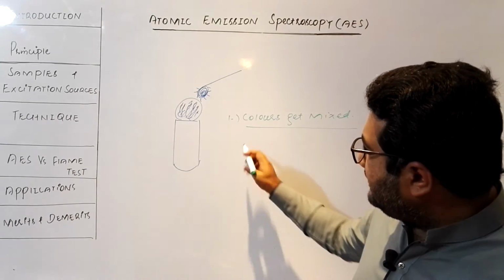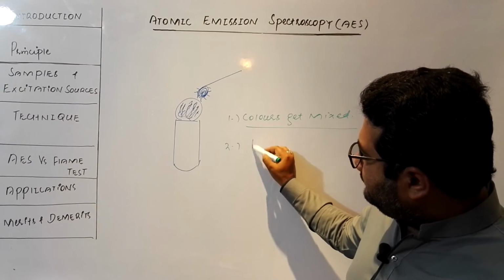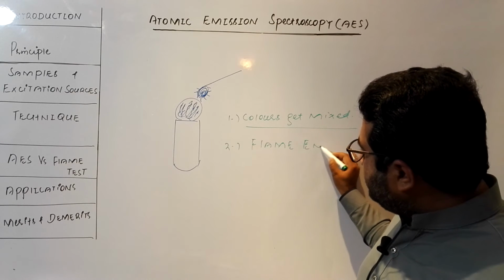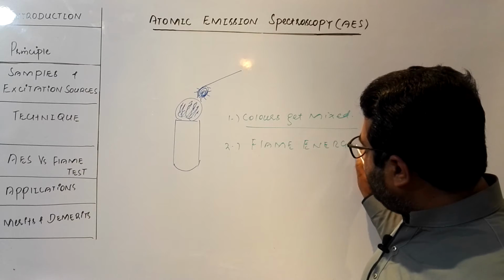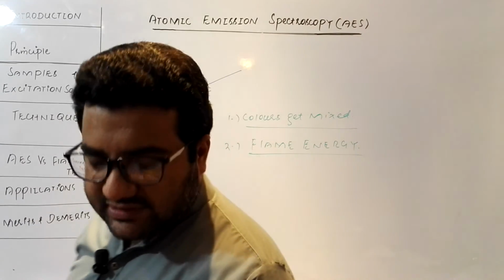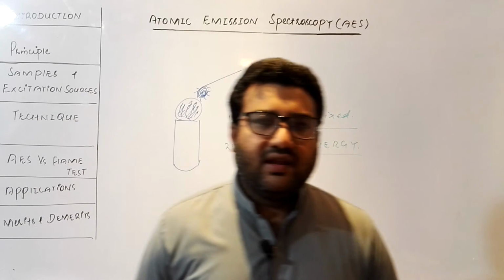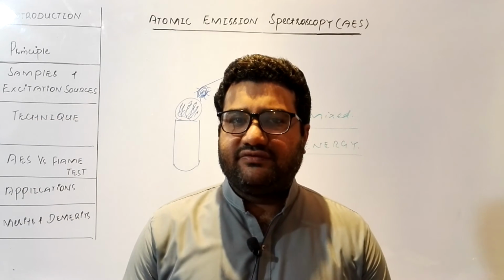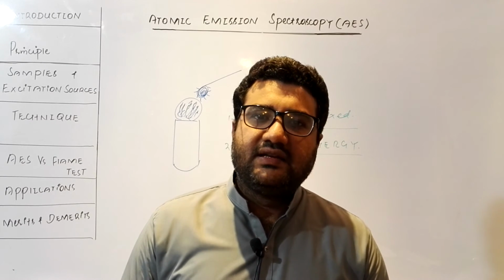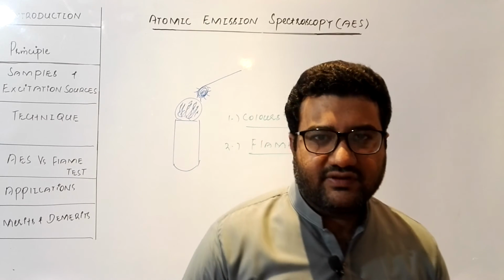The second disadvantage is flame energy. Sometimes the flame does not have enough energy to excite the electrons in atoms. The energy of the flame is not sufficient for the proper excitations that we require for our analysis. So this becomes the second disadvantage of the flame test.